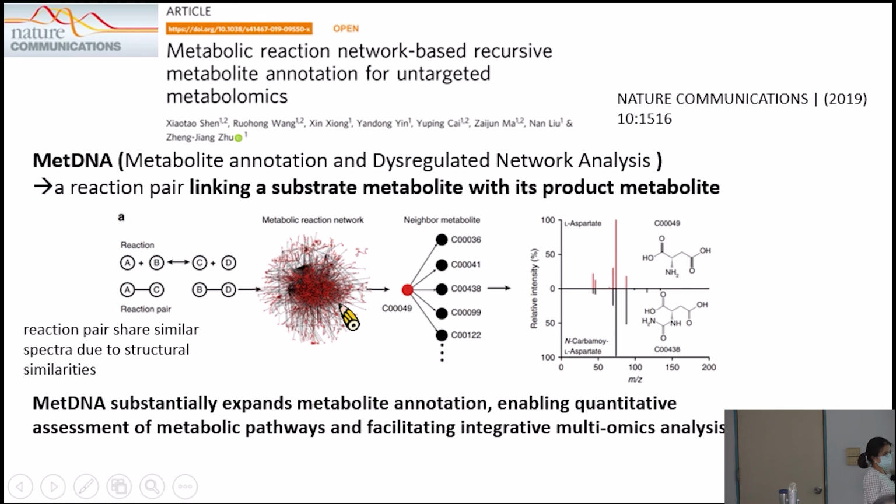Because based on my understanding of proteomics, the fingerprint of one protein shows multiple peaks because the protein can be cleaved by trypsin, and each fragment has a different molecular weight. So I don't understand why a single compound can give multiple peaks.